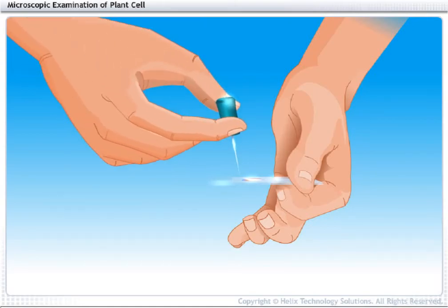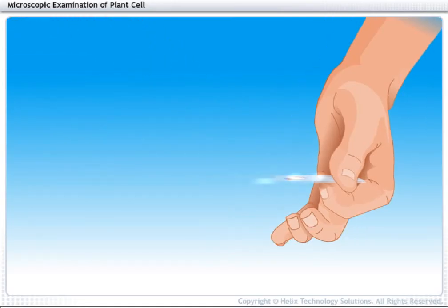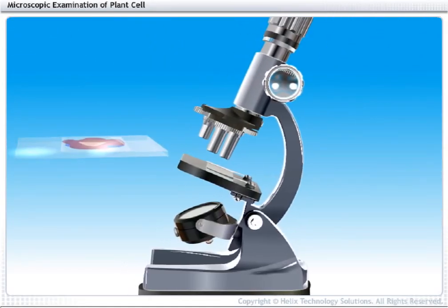Tap gently with a needle on the cover slip to remove air bubbles. Place the slide on the stage of the microscope.